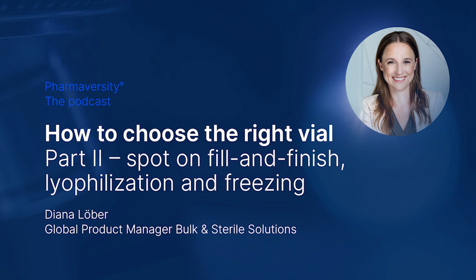So for this session, it is about fill and finish, lyophilization, and freezing. Let's start with fill and finish. What are the main challenges here? It actually starts already with the kind of fill and finish machine, respectively the equipment you choose. A machine using ready-to-use containers, so pre-washed, pre-sterilized vials in a nest, for example our Adaptiq vials. Using such a technology, in which these containers are also processed nested, has a totally different impact than traditional bulk filling lines.